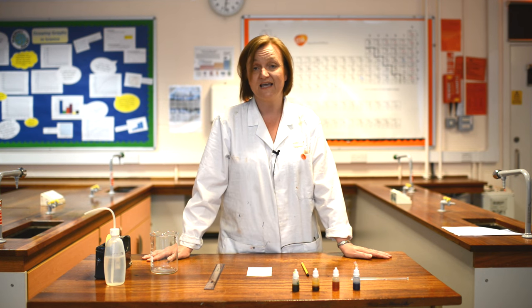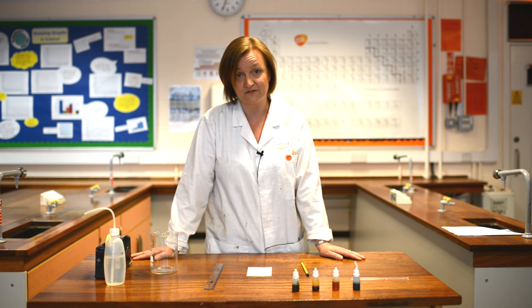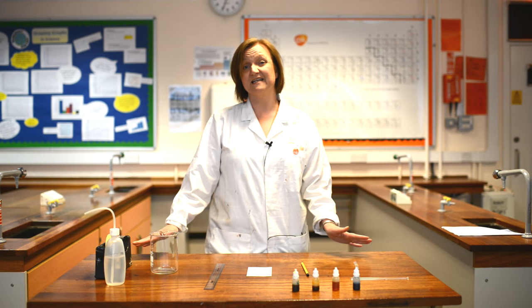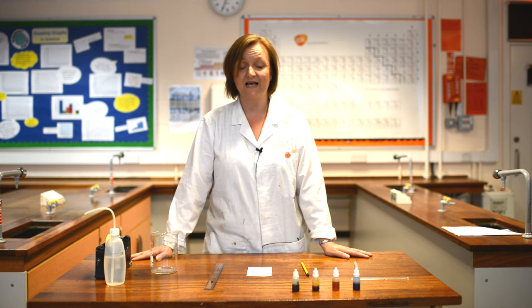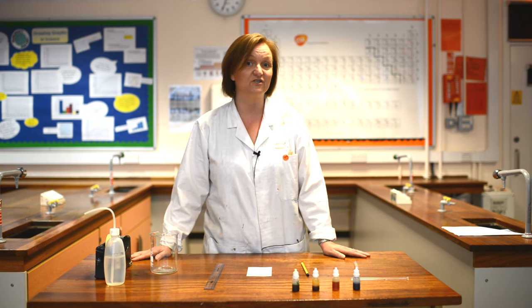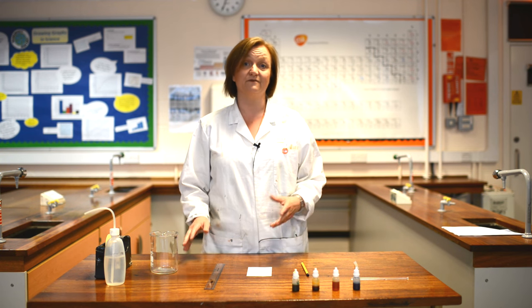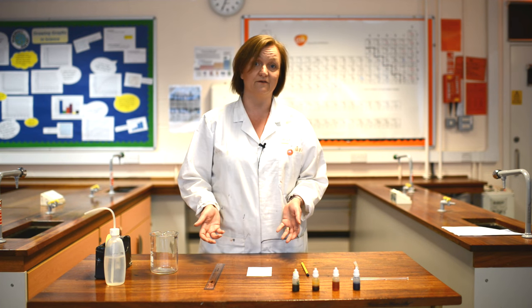It's used every day by real chemists in lots of different guises. Chromatography works the same whether you're doing it in the school lab or in a professional lab. There are basically two phases: a mobile phase and a stationary phase. The components in the mixture separate out depending on how much they like to be either in the stationary phase or the mobile phase. The more they like to be in the mobile phase, the more they move.